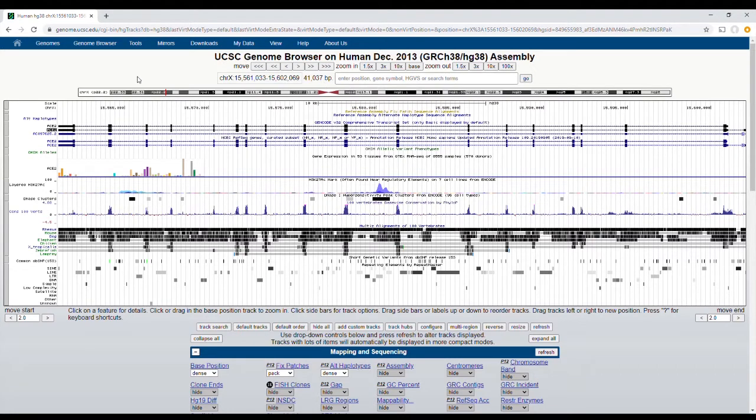Now what I can do with this is zoom in a little bit, and ultimately get all the way down to the base sequences. If you look at the top here, where I've brought my cursor, this is going to show me any sort of different haplotypes. If I move my cursor down, I've got an alignment of a number of different vertebrates, and the top one listed is the rhesus monkey, then the mouse, dog, elephant, chicken, X. tropicalis, zebrafish, and lamprey.